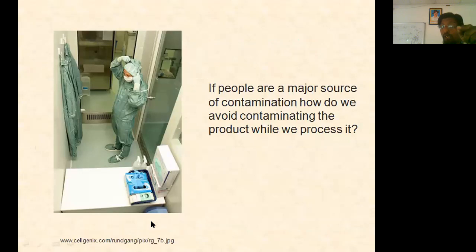So if people are a major source of contamination, how do we avoid contaminating the product while we process it? We will wear all these things. We will wear headgear, we will wear a mask, shoe covering, apron, and everything will be closed from top to toe, and our skin, except eyes, nothing should be exposed. Even for eyes, there will be protective glasses, right?